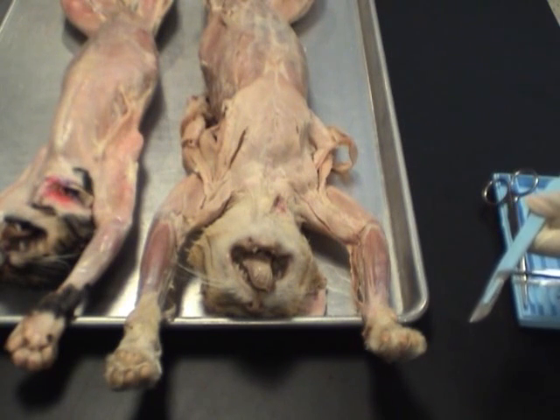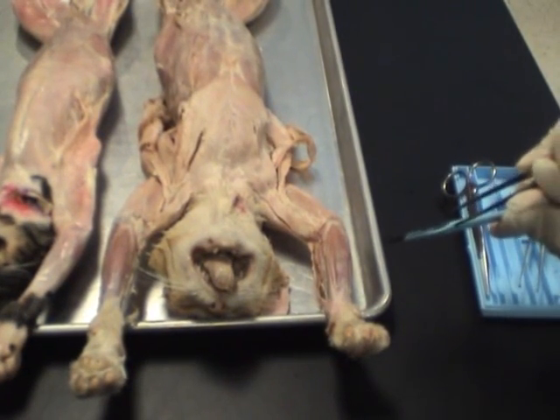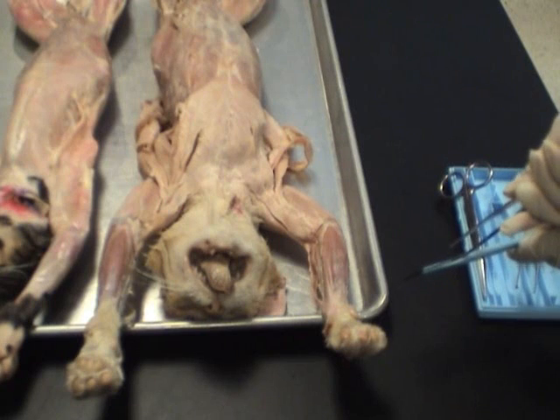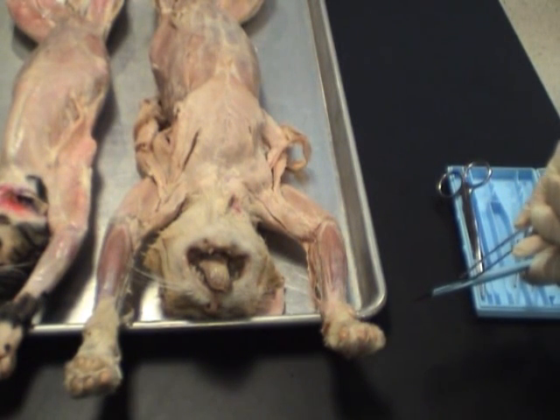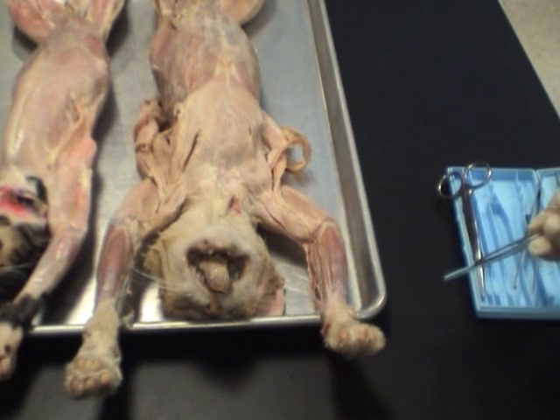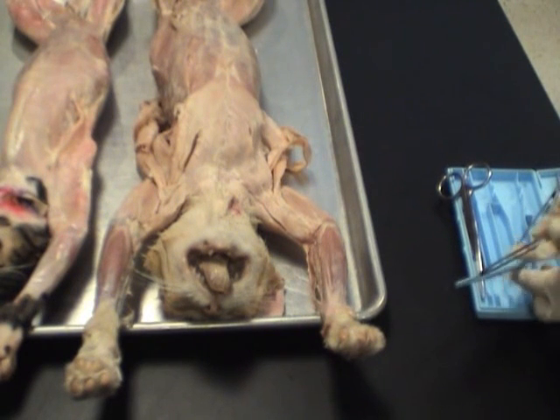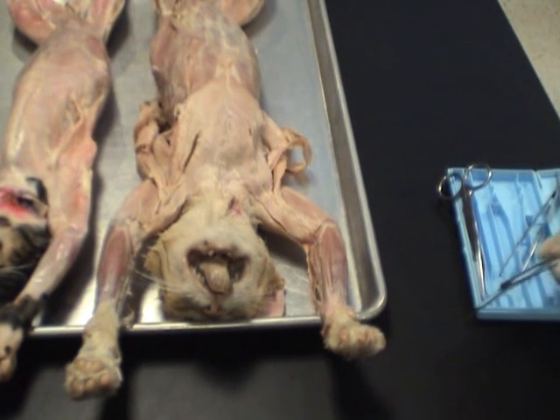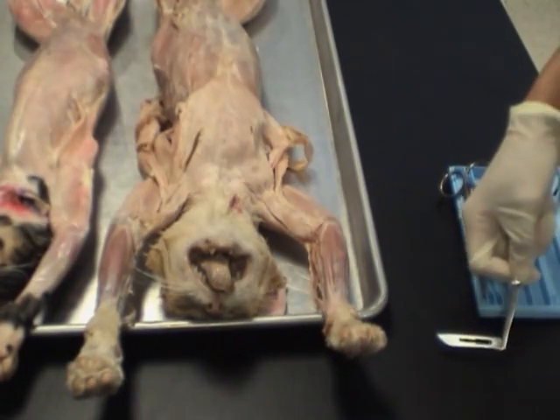What you will do is use the pickup and lift up the blade by the end here. Lift up the blade a little bit, and now you can grasp the end of the blade. With that, we will push the blade in this direction, and it should come off. There we go. As it comes off, you can then deposit the blade in the sharp container.